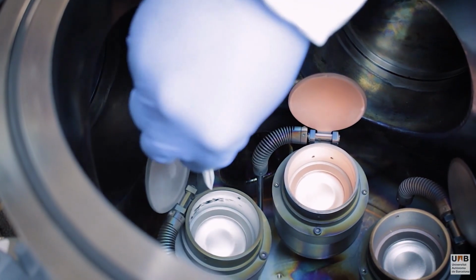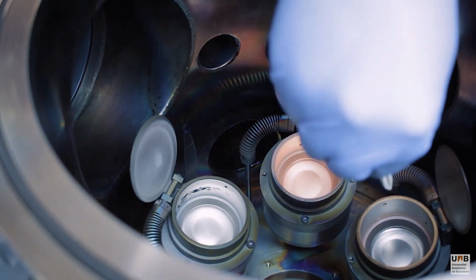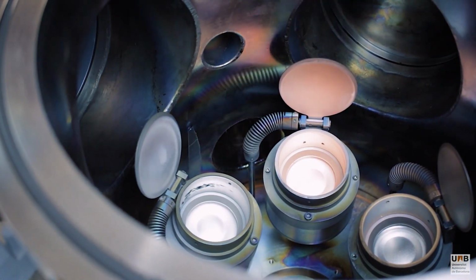So over here we have cobalt, here we have copper, which looks pretty characteristically red and pink, and then we have titanium. Today we're going to take our wafer and we're going to sputter titanium as an adhesion layer and then copper.